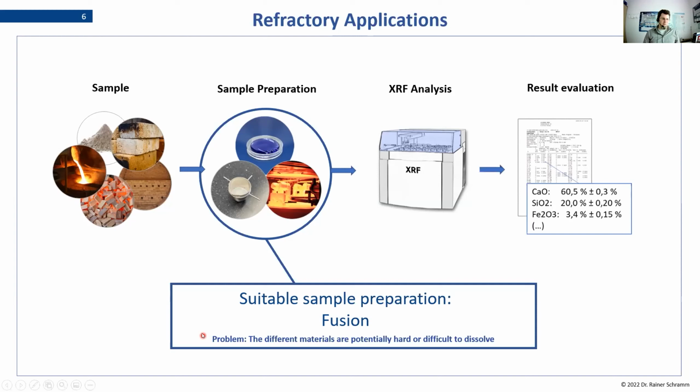But there is, of course, a problem here, because due to the qualities of the material we talked about before, the samples are pretty hard mechanically, and some of these elements are very hard to dissolve. So how do we solve that in preparation?